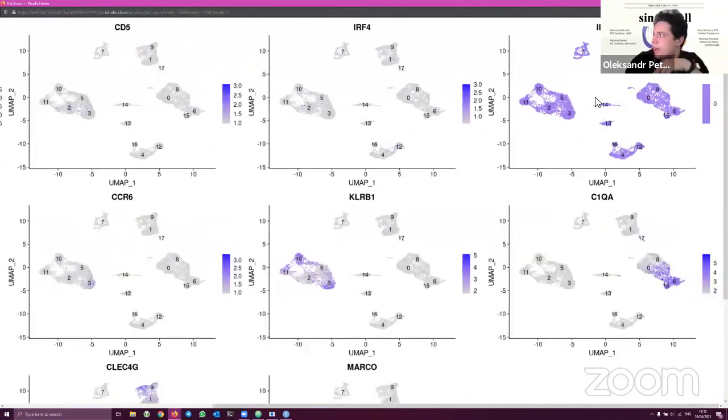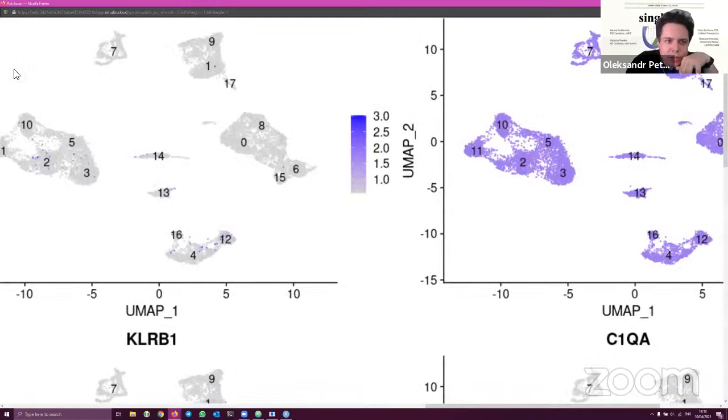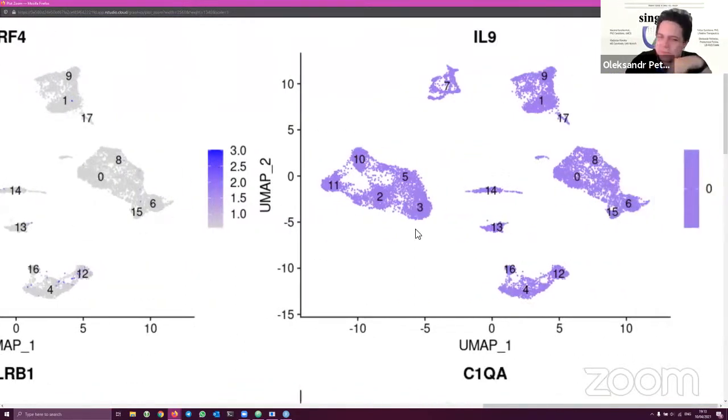Let's say from, I think, interleukin 9. So it's from the Andrea data set. Did you study B cells or which cells? Could you remind me? Or T cells? What did they tell you to find? Okay, if Andrea is not here, because we can hear her. It's T cells. Yeah. T cells.